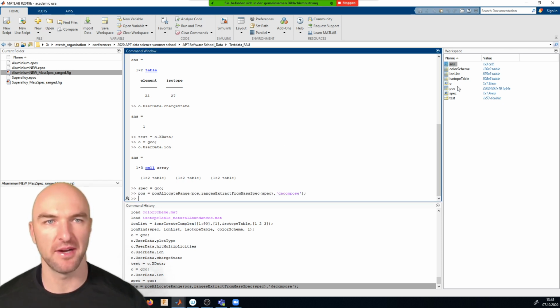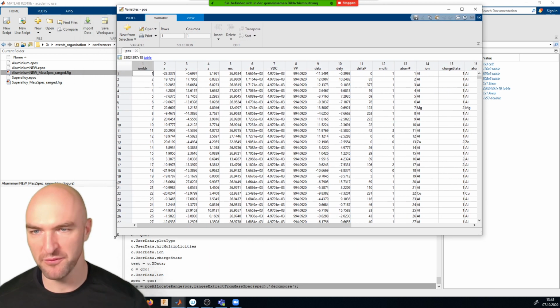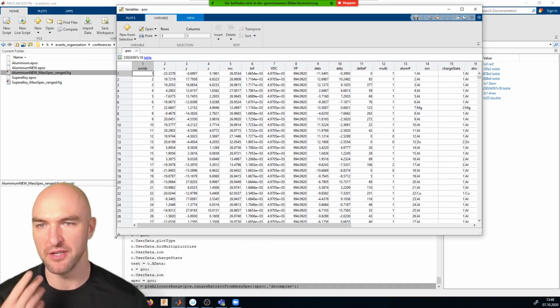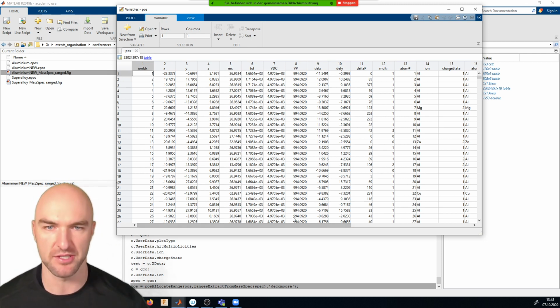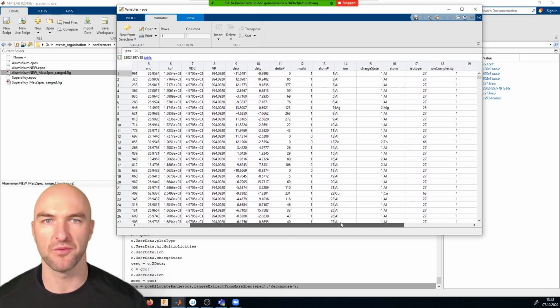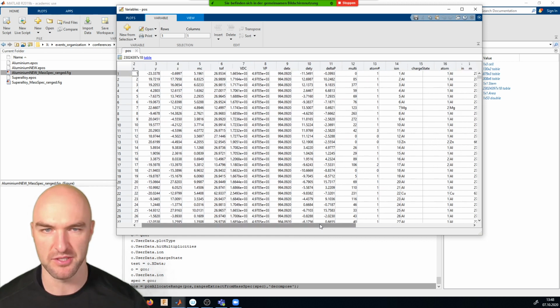And now if I look at my pos variable, sorry, I know Martina always keeps them separate. I usually overwrite them. And so if you change ranges or anything, you need to redo that step again, okay? So if you change a range, obviously you need to reallocate the ranges. And here then we've got all the different information displayed.